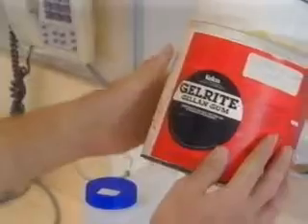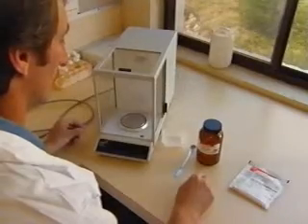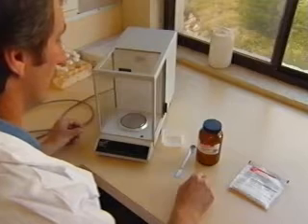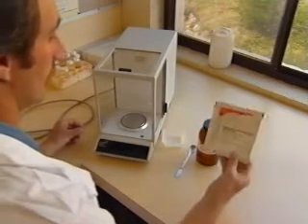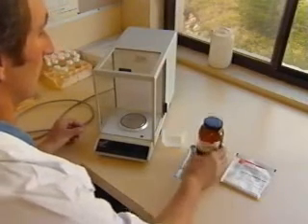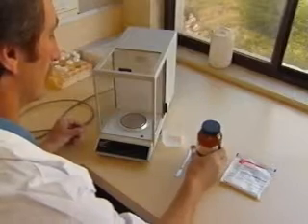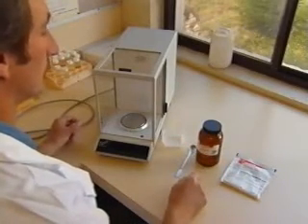To this mixture, we also add sugar as a source of energy and plant hormones when necessary, as well as a gelling agent. To prepare a batch of media, we can either use pre-mixed media such as Murashige and Skoog, Gamborg, White, etc., which can be purchased from chemical companies such as Sigma, which has a wide range of media in powdered form.